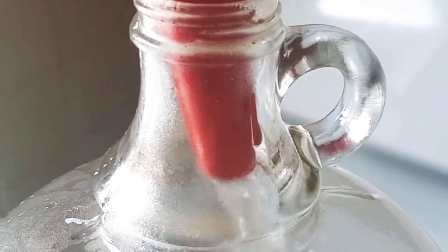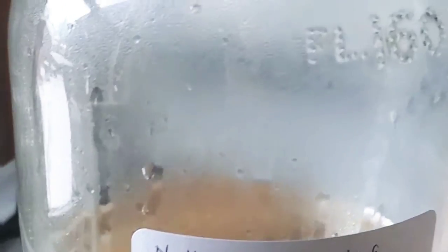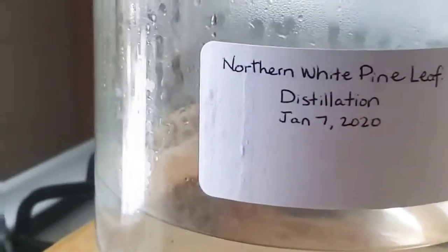I'm back — it's been about a half hour since I turned the element off. Look at that — there's our distillate right there! We got a pretty good yield, about three-quarters of the bowl. It's still a little bit hot so I'm going to let it cool for a bit, and then we're going to decant that into the bottle.